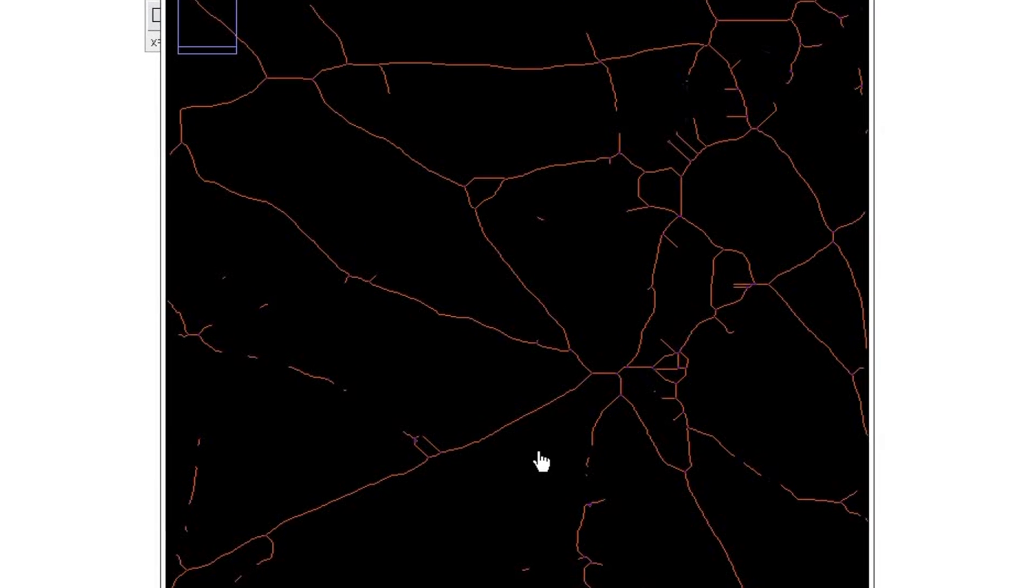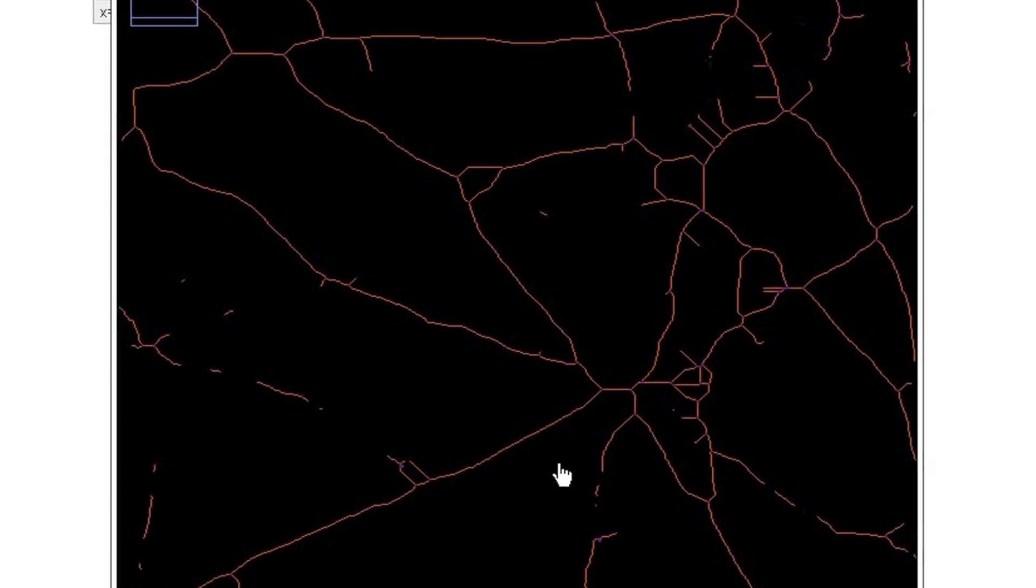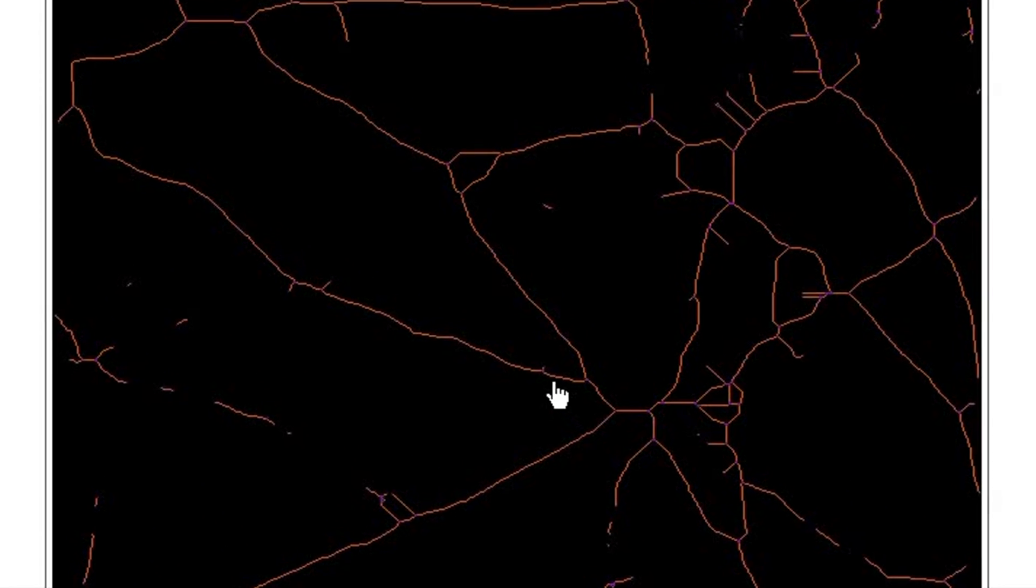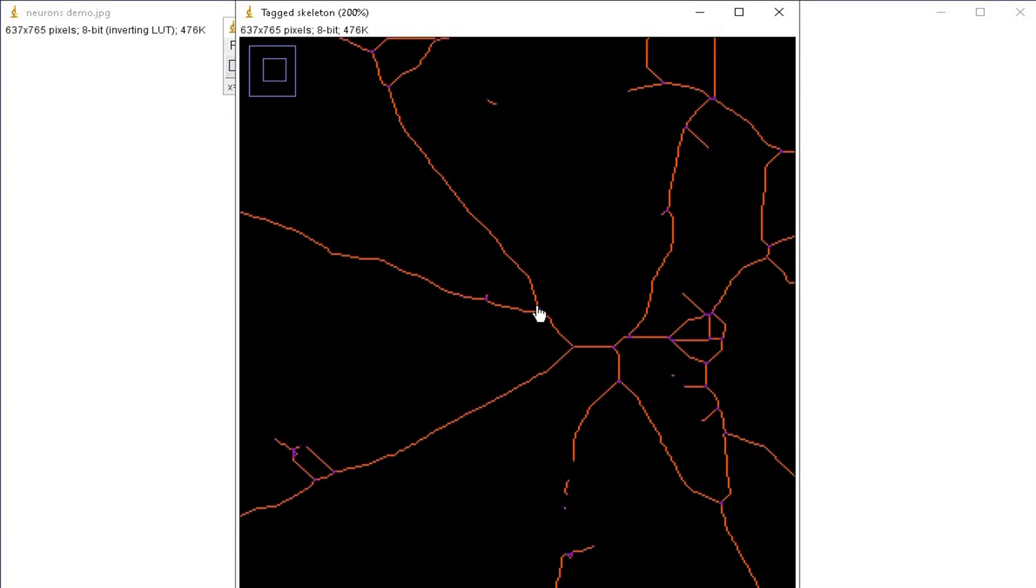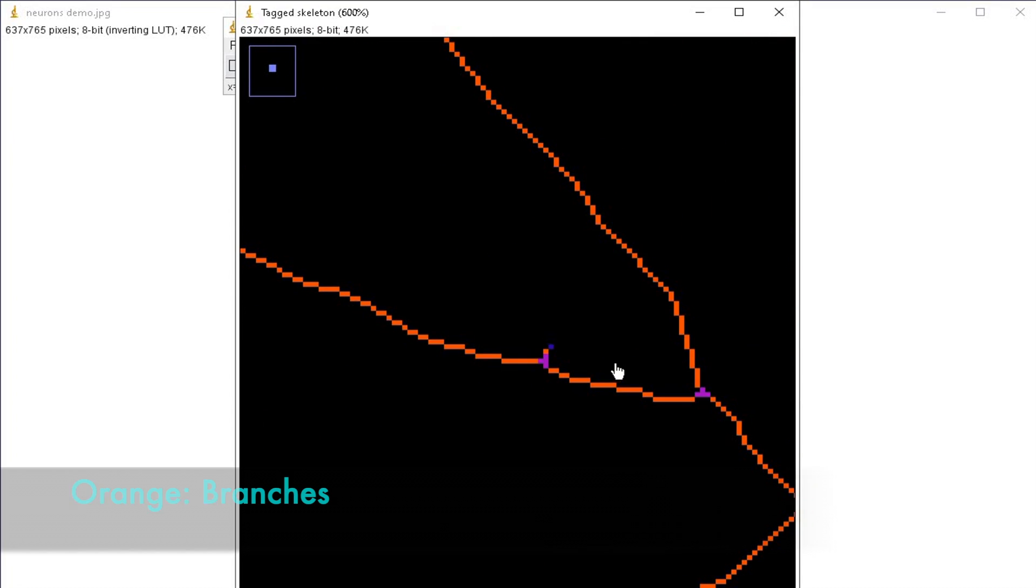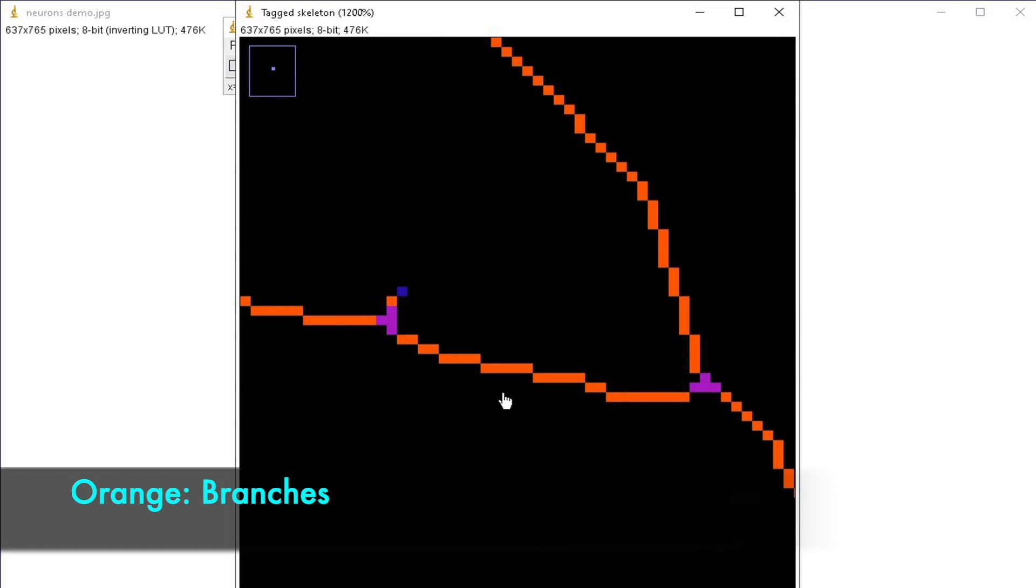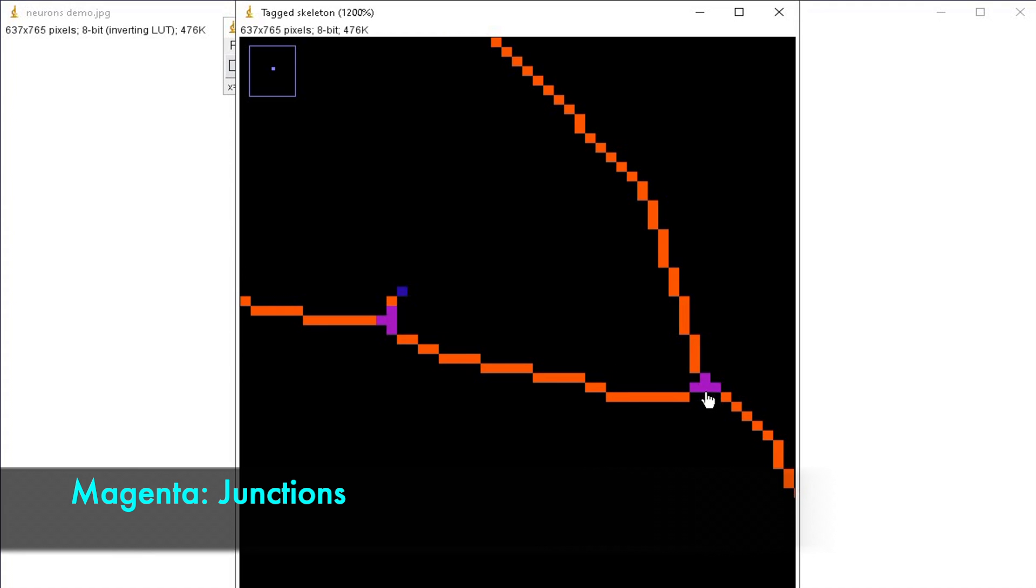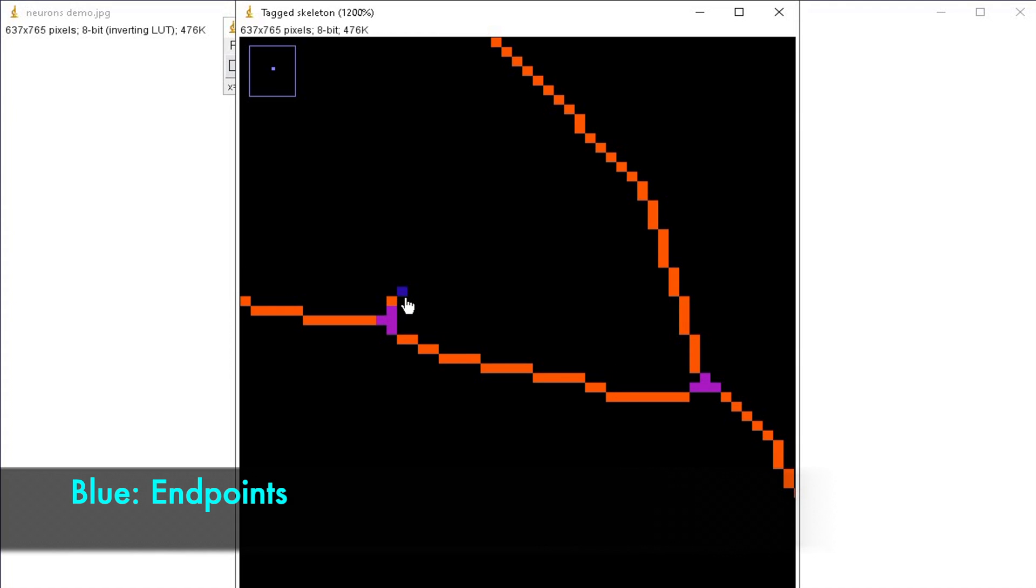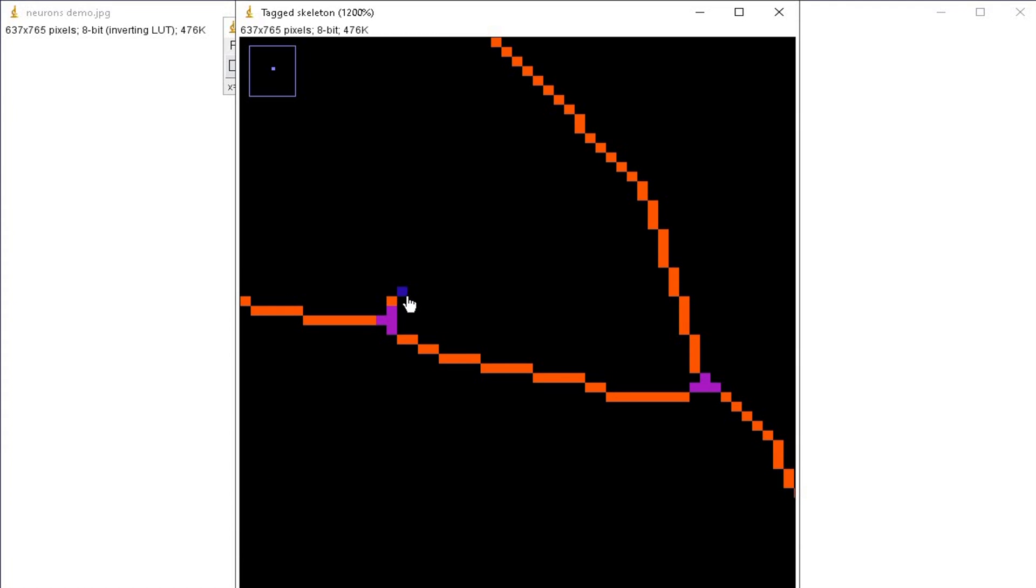The tagged skeleton window shows the skeletonized branching in three different colors. Here, the branches are labeled in orange, junctions in magenta, and endpoints in blue color.